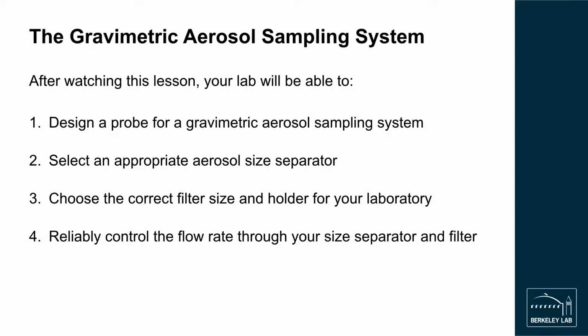After watching this lesson, your lab will be able to design a probe for gravimetric aerosol sampling, select an aerosol size separator, choose the correct filter size and holder for your laboratory, and reliably control the flow rate through your size separator and filter.